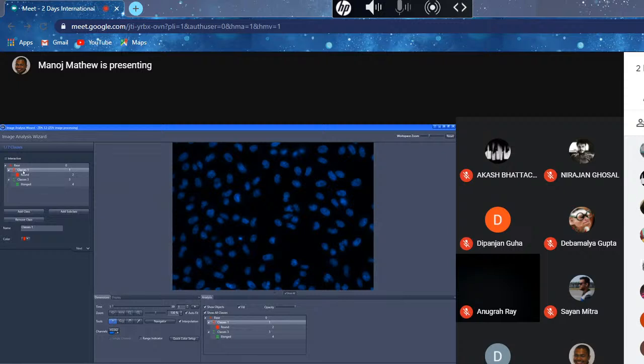So let me call this round group, and let me call this elongated group. We already got some hint here. The group class, go back. The group class is doing a group measurement. It's doing a global measurement. And the class itself is doing a local measurement.